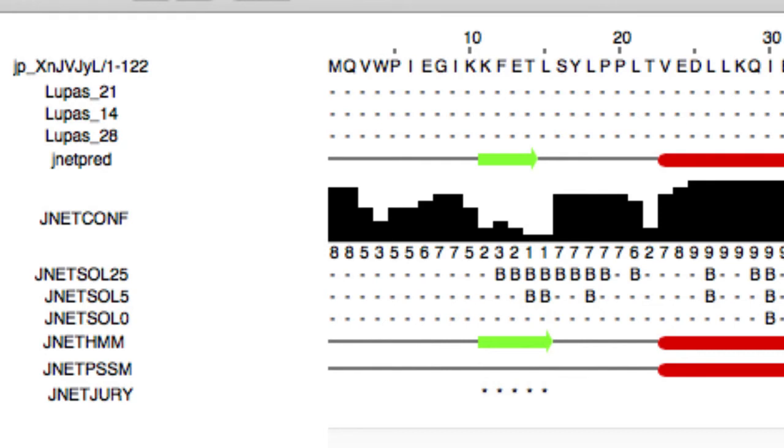JNET makes two predictions from different profiles: JNET HMM and JNET PSSM, then constructs a consensus. The JNET CONF row displays the confidence estimate for the prediction. High values mean high confidence.